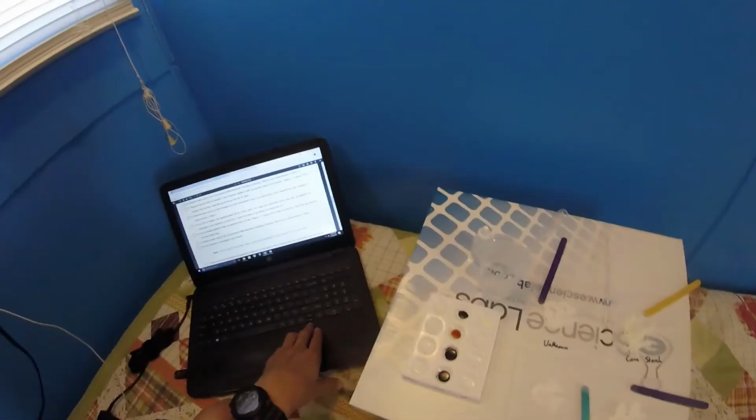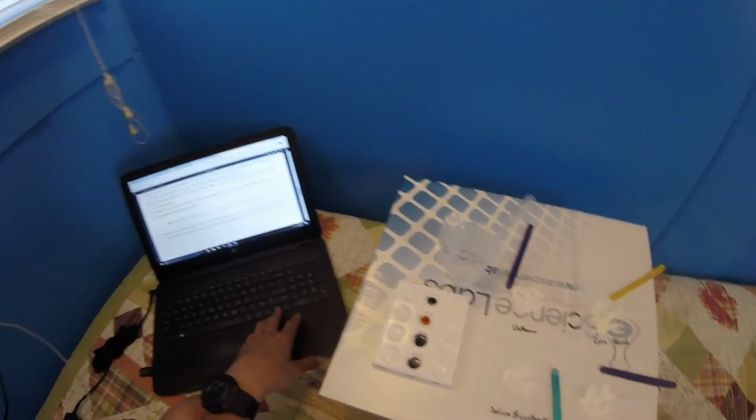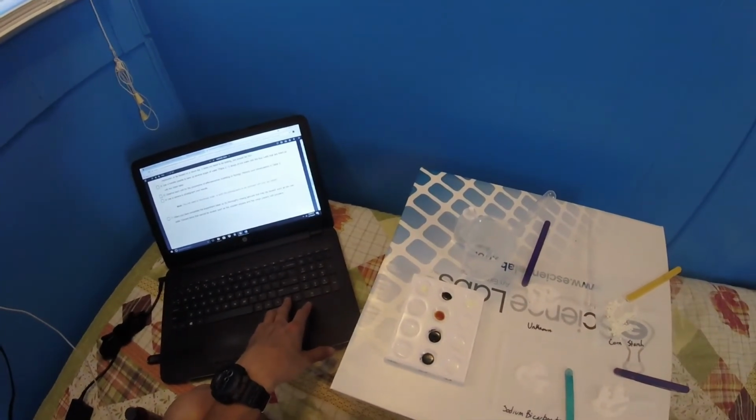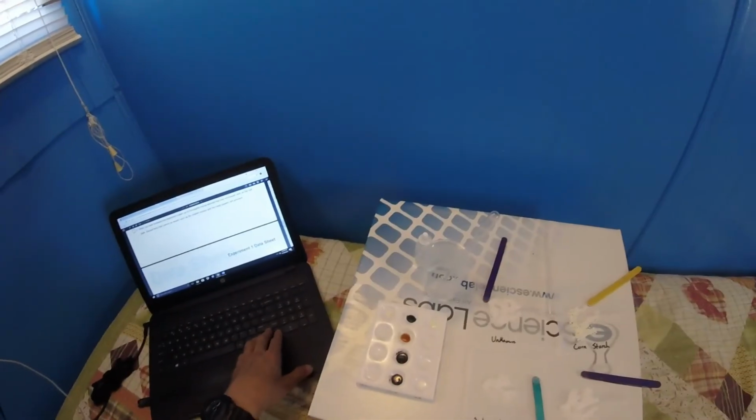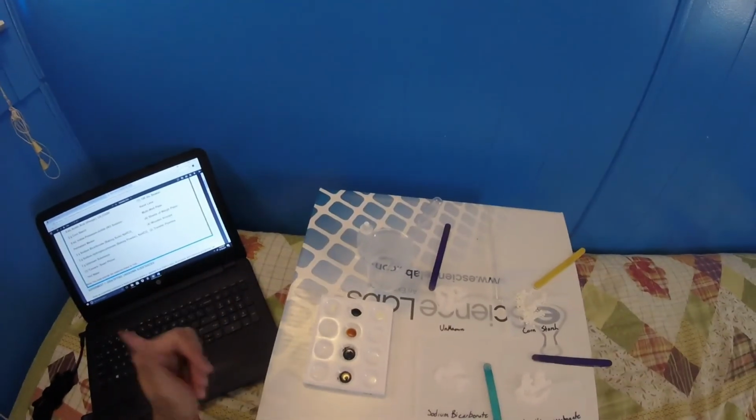Okay, and when you have completed the experiment, clean thoroughly, rinse labware that may be used, such as the well plate, discard the items. Okay, so that was the lab 1 for identifying unknown substances.